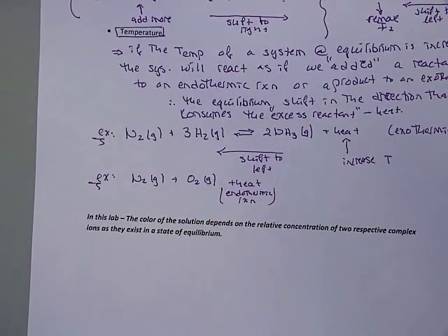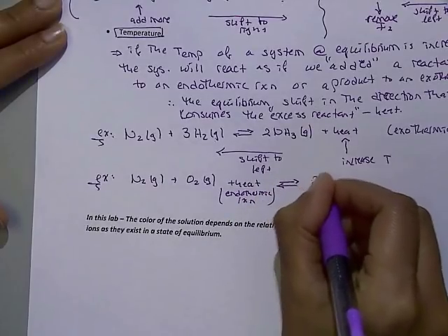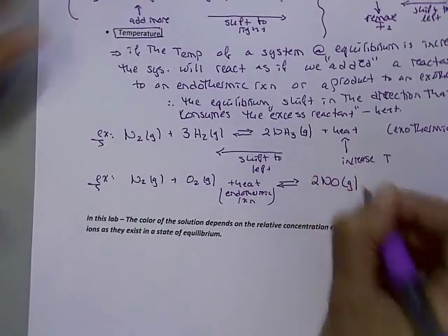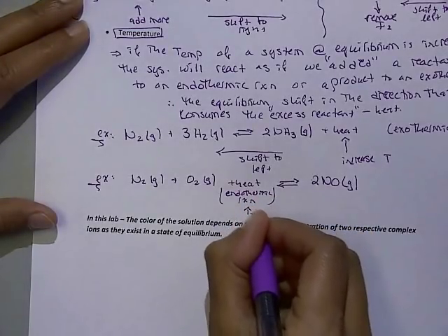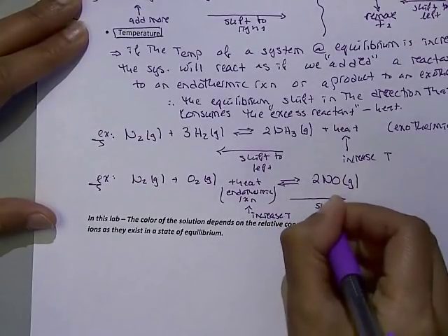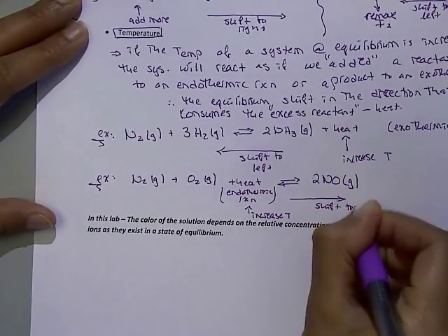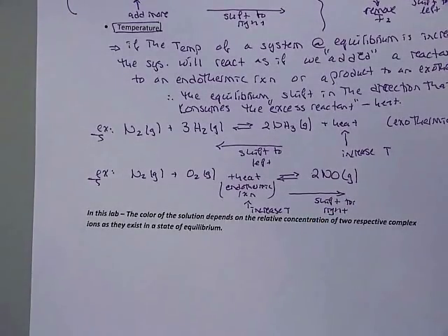These types of reactions are ones where, if you held the test tube, it would go, for example, from room temperature to cold. So here, this reaction produces nitrogen oxide, or nitrogen monoxide. If we increased our temperature here, what happens is your equilibrium will shift to the right to produce more nitrogen monoxide. So the equilibrium always shifts away from what was being increased.